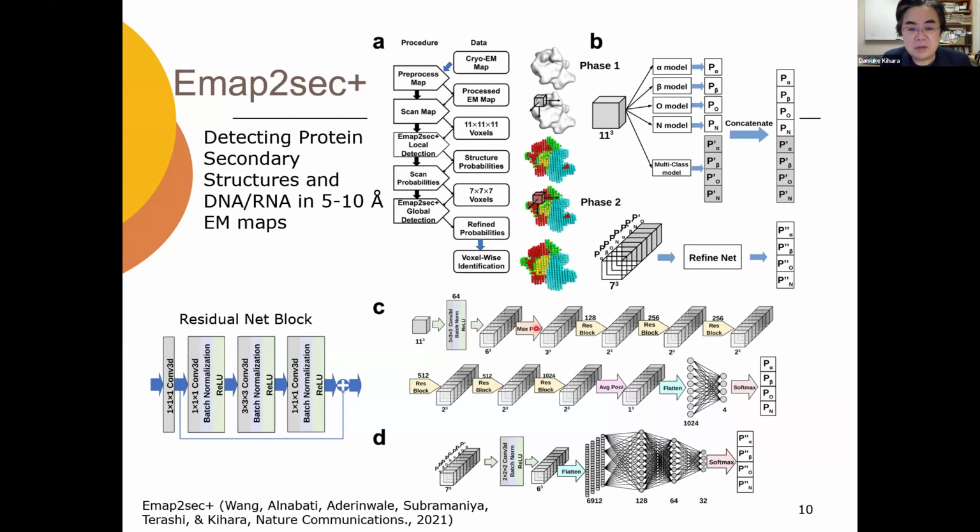And in terms of the architecture of the neural network, if you are interested, it is using the convolutional neural network called ResNet. So ResNet is a bit advanced architecture in deep learning.